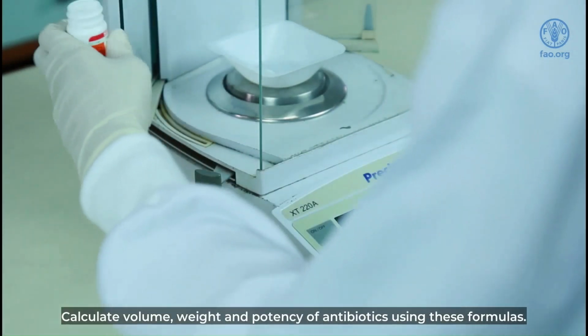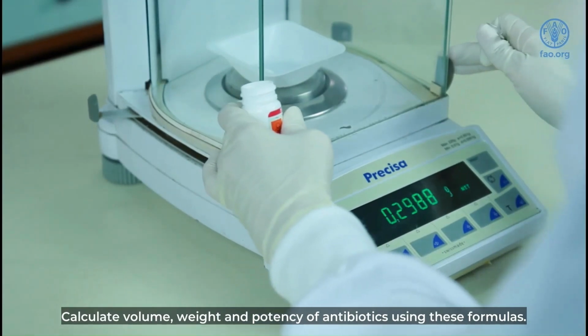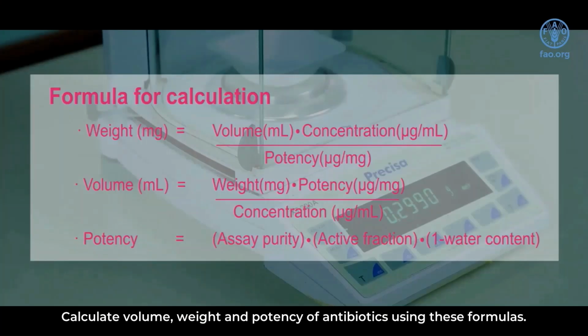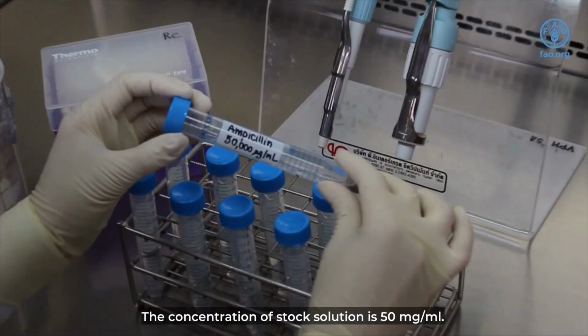Calculate volume, weight, and potency of antibiotics using these formulas. The concentration of stock solution is 50 mg per milliliter.